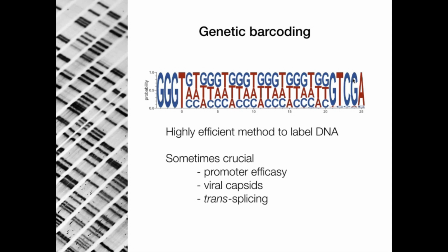So in these events, the event leading up to the final product is lost, and a DNA barcode is the only way to assess what was happening before the RNA. And another great thing with using DNA barcoding is that it's highly efficient, and in our case we only used 3 rats to screen all of the AAV variants that you will see during this presentation.